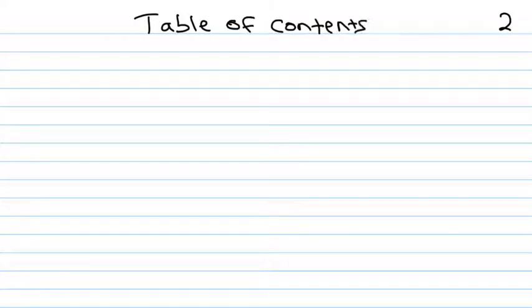Page 2 of your lab notebook will be table of contents as well. This is just in case we fill up the entire notebook and we have to have 2 pages worth of table of contents. That's pretty standard practice, so you just want to get that in there just to cover yourself for later on. That way you don't have to figure out where to put a new table of contents.